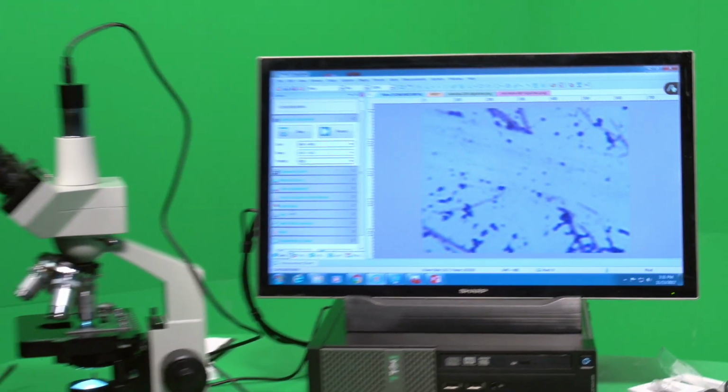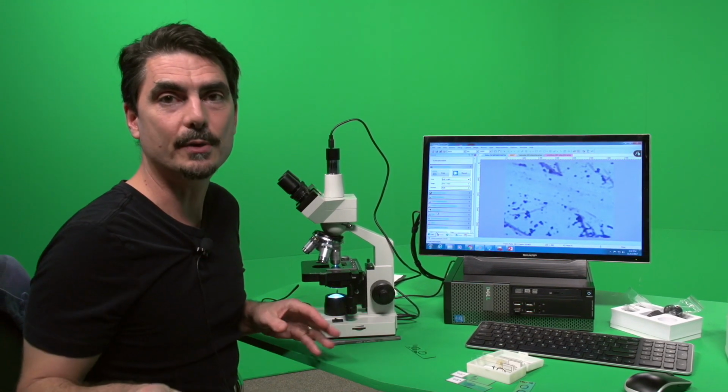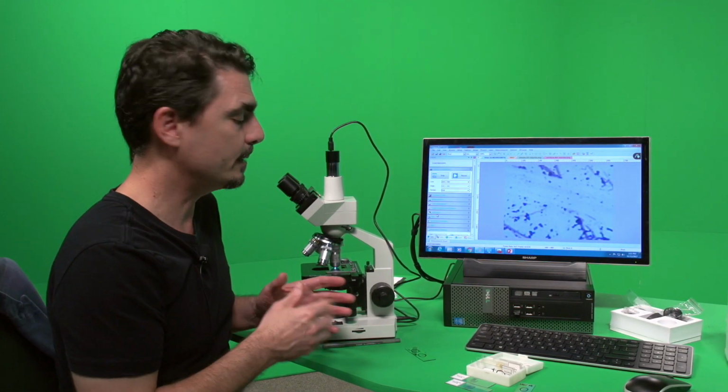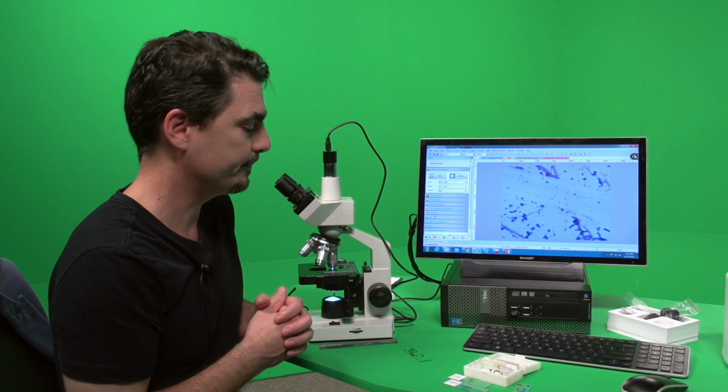That's my guess for that after I did the staining. So this particular one, not particularly good, but still, that's as good as we're going to get. And that's because these bacteria are not the textbook kind of shapes. And that's essentially not uncommon. So sometimes what we'll see is, for example, the slide that we just looked at, where there were a lot of rods, right, with some coccus looked like they were sticking out. Textbook, very clear, that's what a bacillus is. Some of these other ones, they just don't look like the textbook, and that's the way that works sometimes.